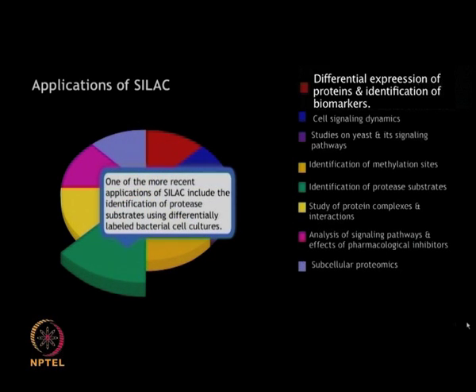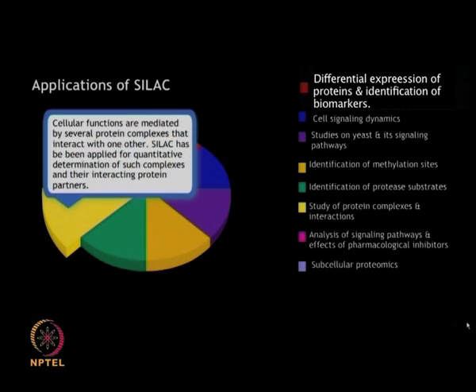One of the recent applications of SILAC includes the identification of protease substrates using differentially labeled bacterial cell cultures. The cellular functions are mediated by several protein complexes which interact with one another. SILAC has been applied for the quantitative determination of such complexes and their interacting protein partners.